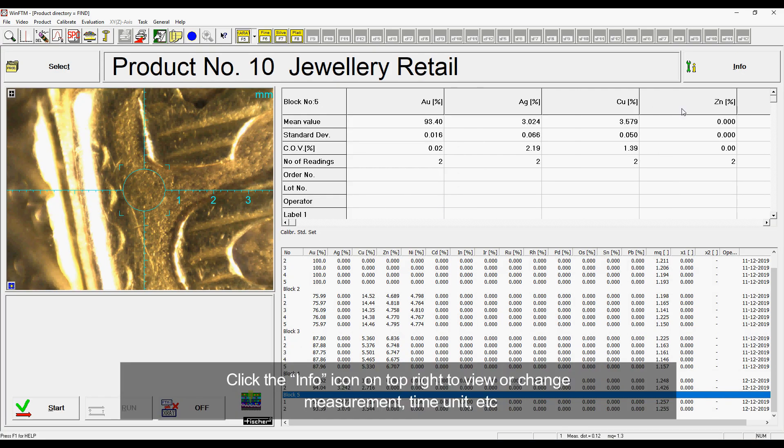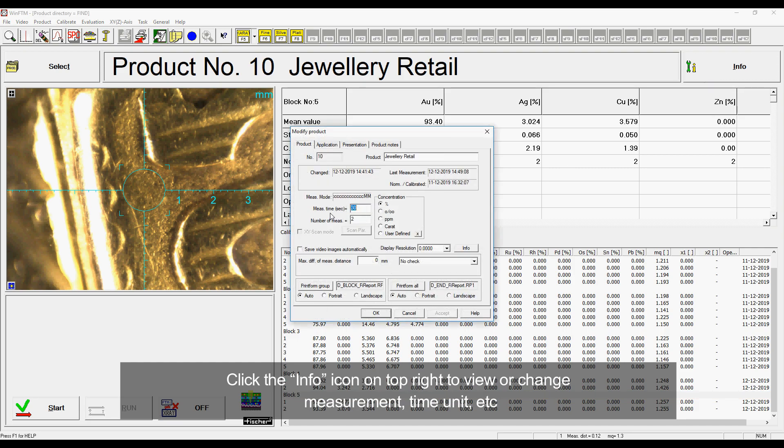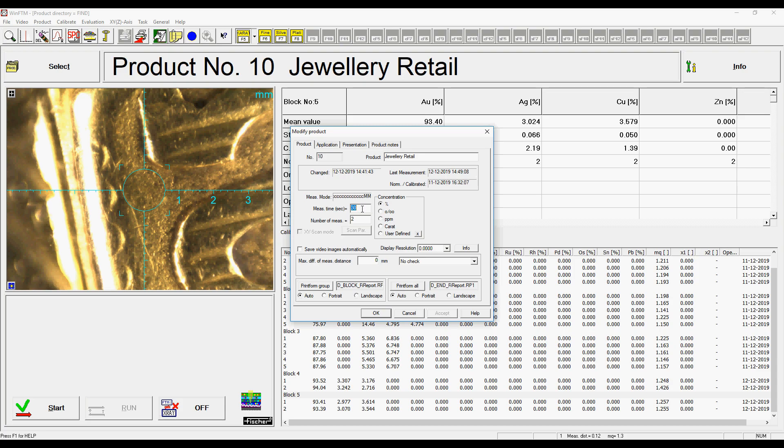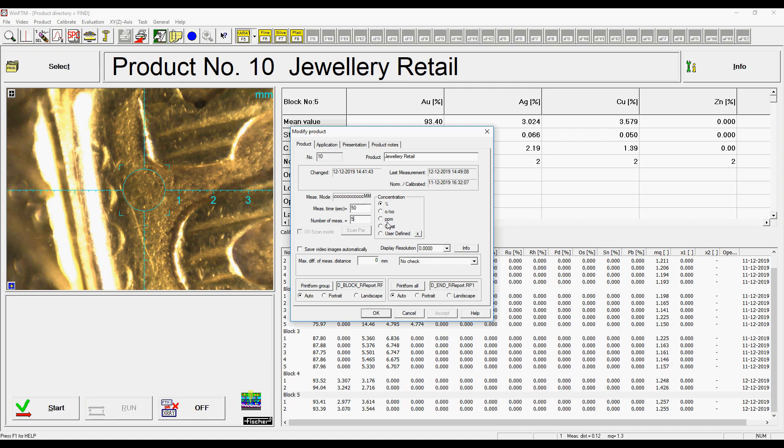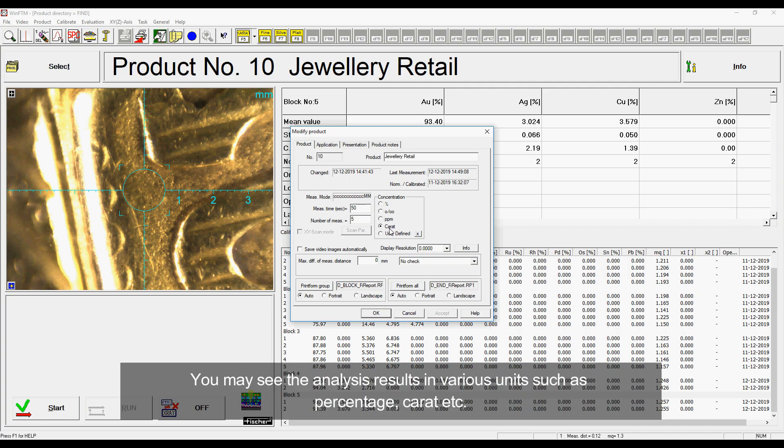Click the info icon on the top right to view or change measurement time, unit, and other information. You can also change the measurement time and number of measurements according to your application. You may see the analysis results in various units such as percentage, carat, etc.